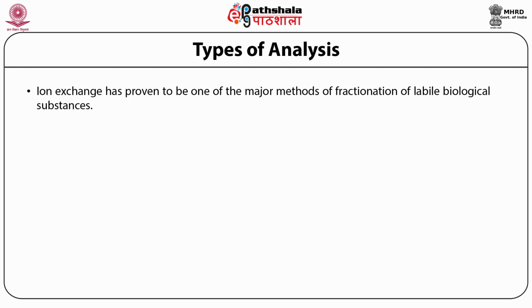From the introduction of the technique in the 1960s to the development of modern high-performance media, ion exchange chromatography has played a major role in the separation and purification of biomolecules and contributed significantly to our understanding of biological processes.